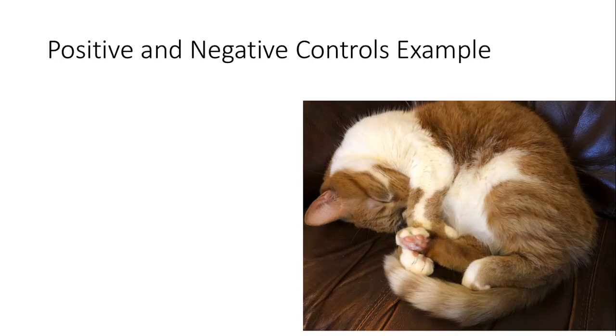Oh, ravioli. We did need a ravioli break. Okay, so let's talk a little bit about positive and negative controls.